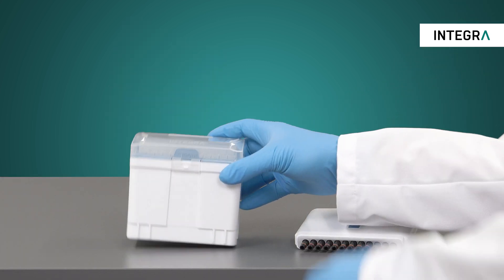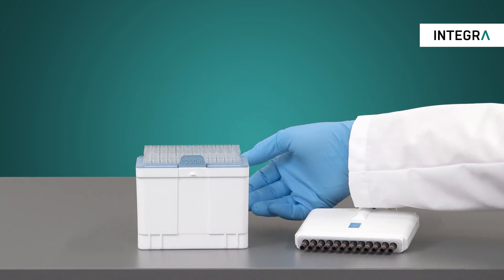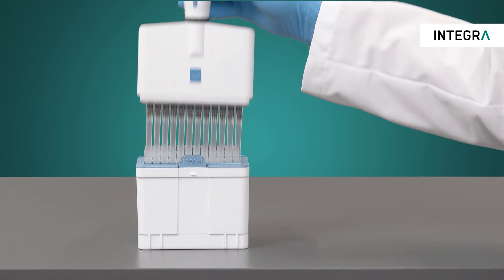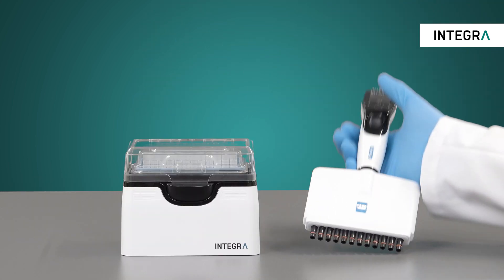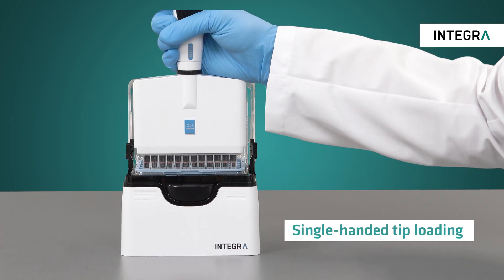These racks also solve another common problem. Do you ever have to set your labware, sample, or pipette down on the bench because you need to open a pipette tip rack? Perhaps you prefer a sturdy tip rack so pipette tips can be loaded using only one hand.